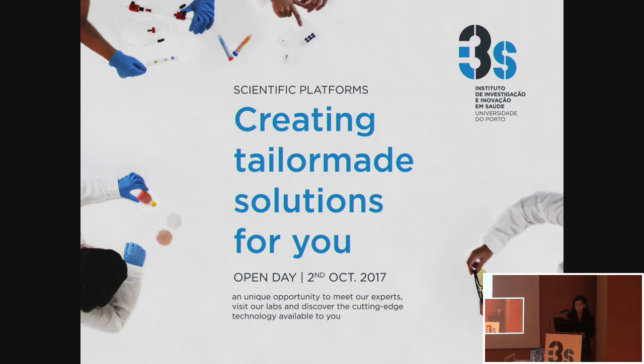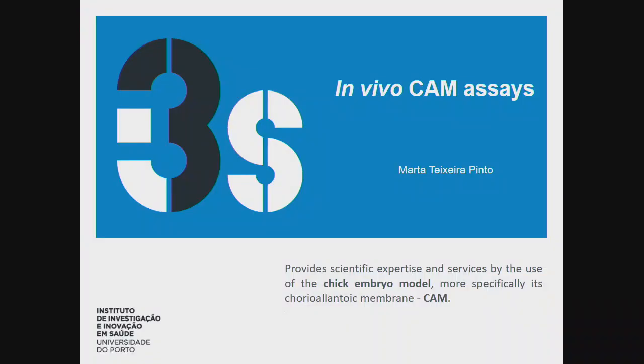Good morning again. Sorry, it's me again. So now I will present the platform that I'm responsible for. The platform is in vivo CAM assays, and we provide scientific expertise and services by the use of the chick embryo model, more specifically its chorioallantoic membrane, the CAM.